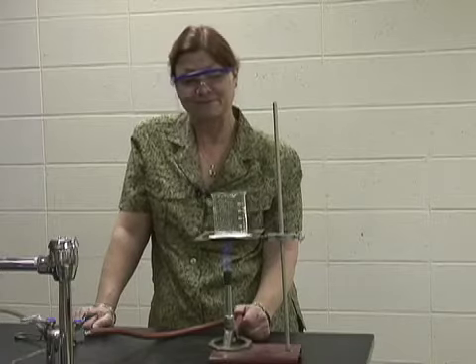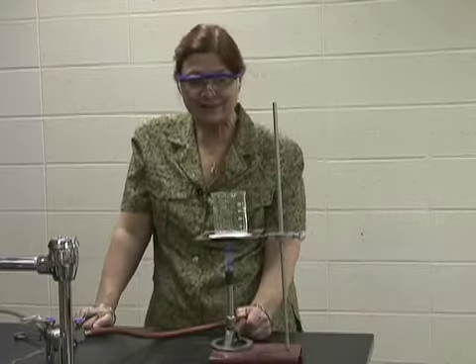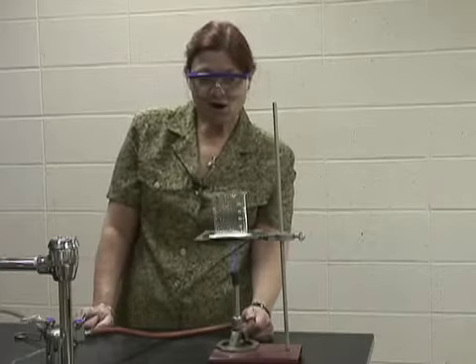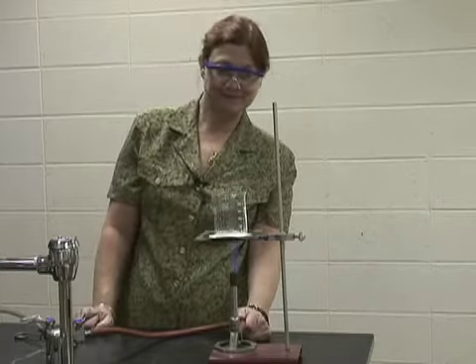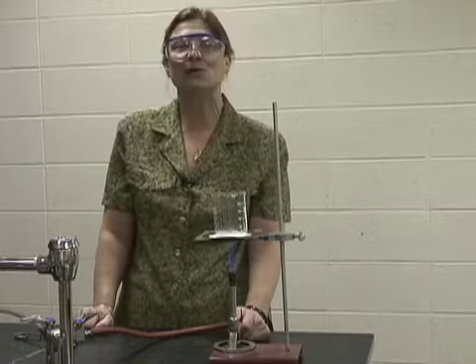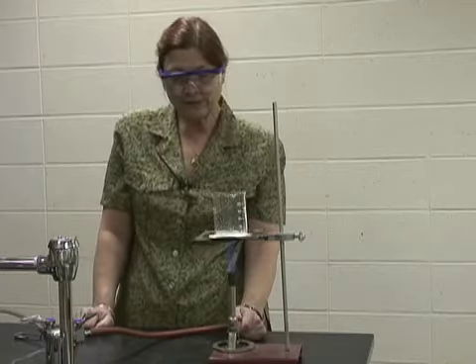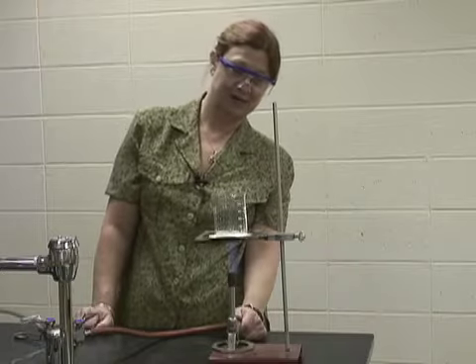Oh my, we're almost done. Woo, look at that thing. It's like getting solid in there. And all that liquid is evaporated out into the atmosphere. Water vapor, making a little humidity of our own. Now I want to make sure I get all the liquid out of there, so I want my product to be dry, dry, dry.